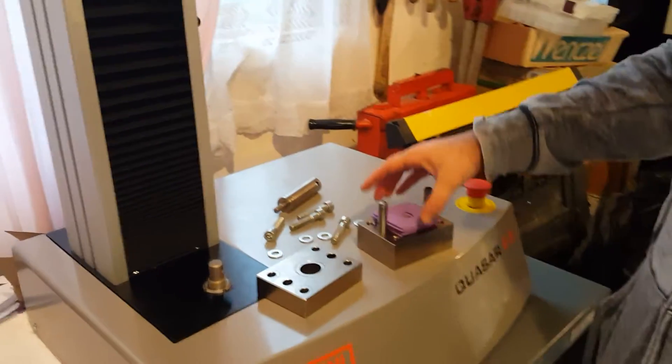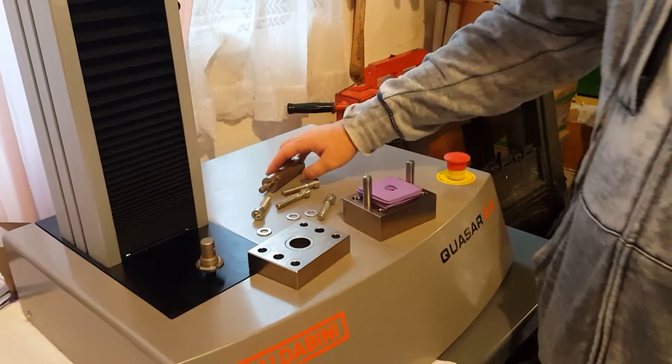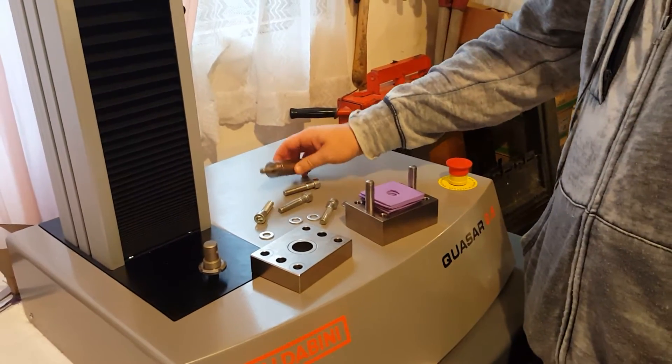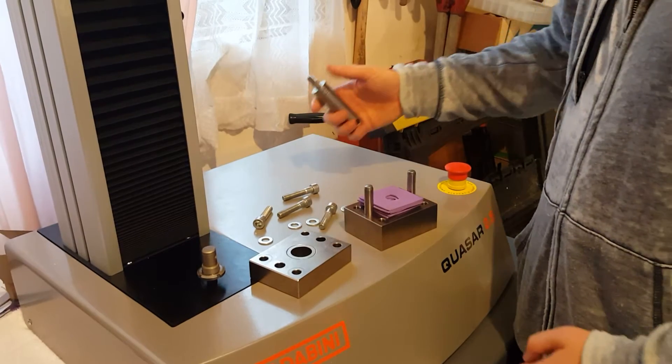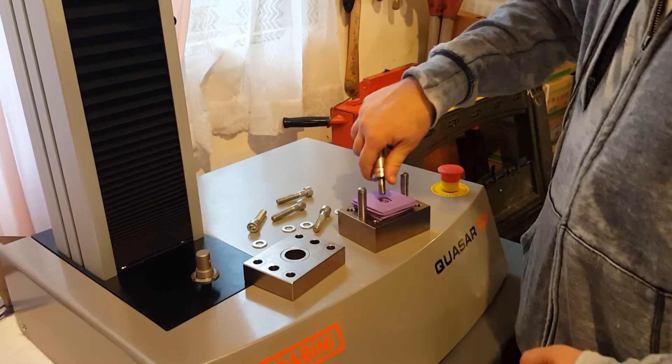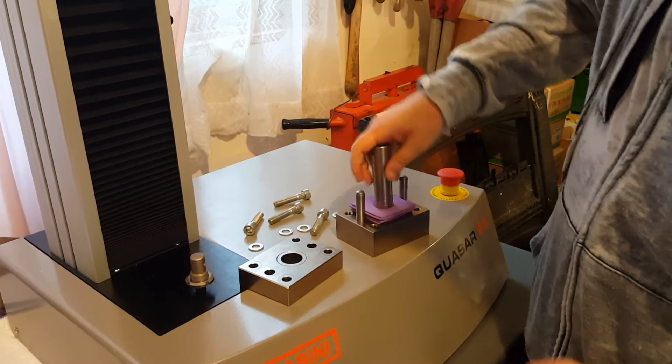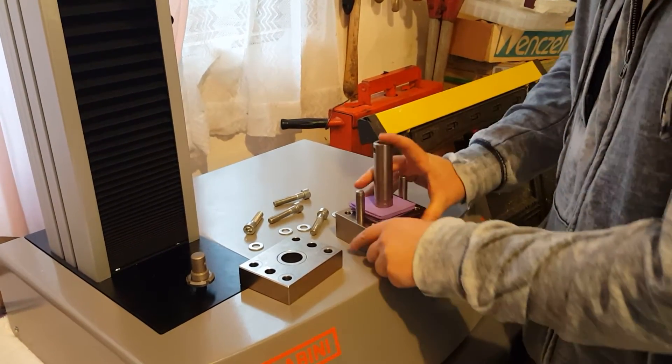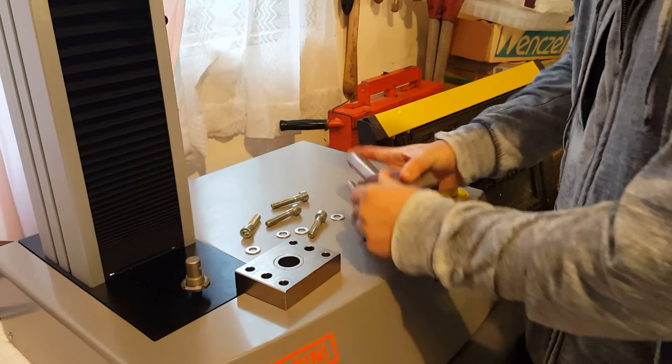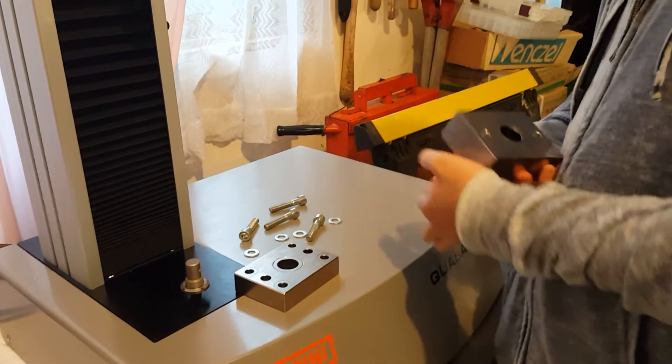We go ahead and place it on the base of the fixture. Now we have our puncture plunger here. I'm going to go ahead and put it on, flip it around.